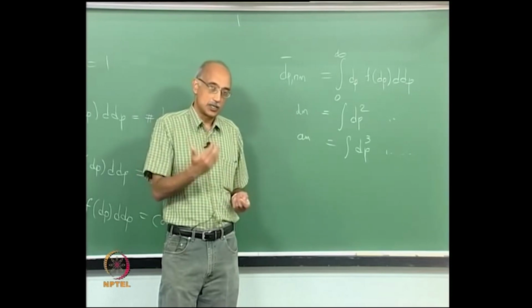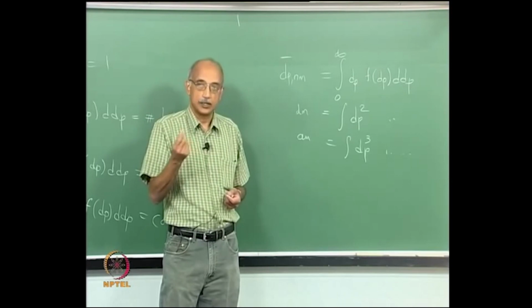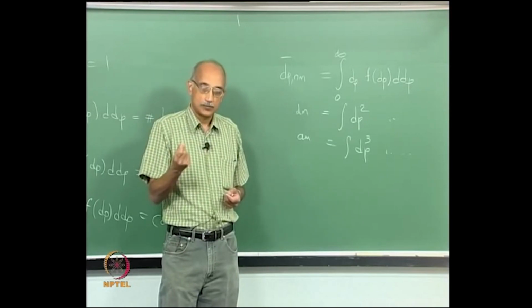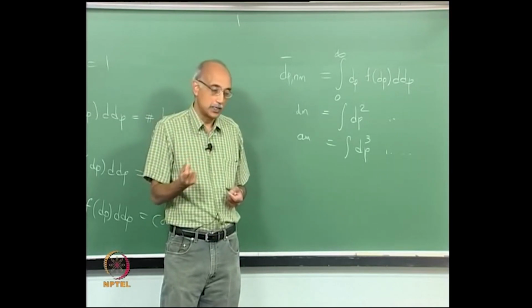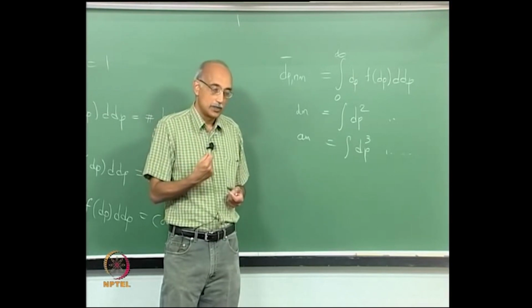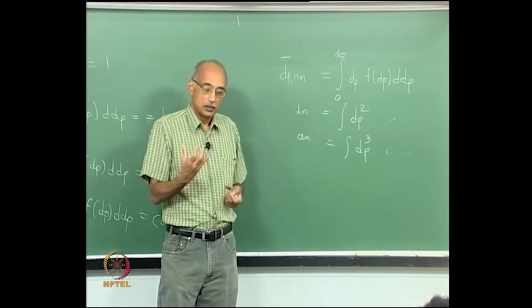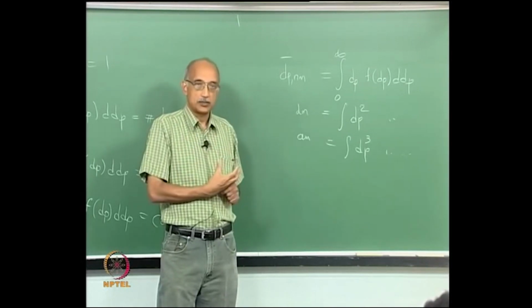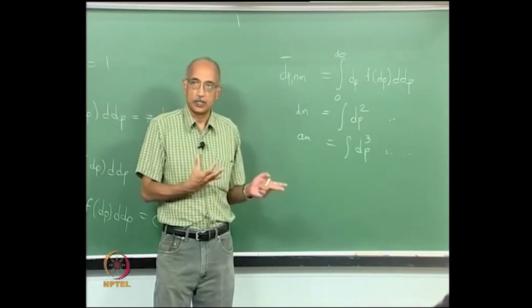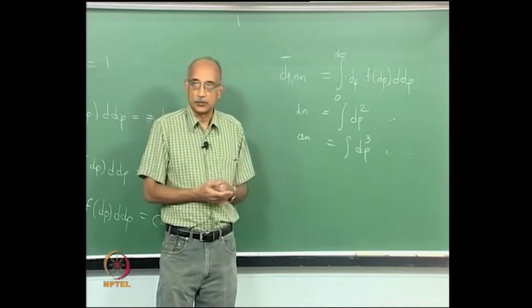So when you try to extrapolate the technique from usage for a single particle to an assembly or collection of particles, you have to bear in mind the fact that there are errors involved, and when you are trying to obtain a size distribution, as far as possible try to refer back to some standard spectra that are available, just like you do if you have used FTIR spectroscopy, right.